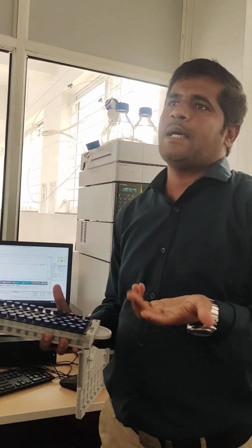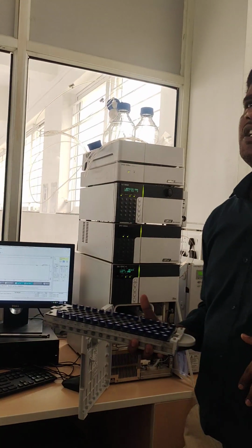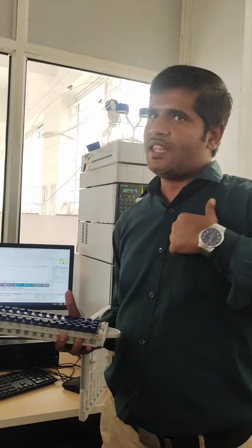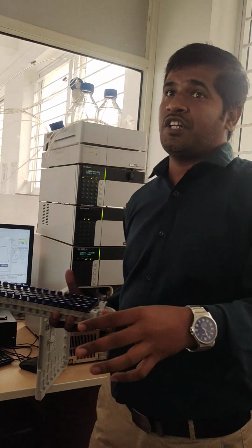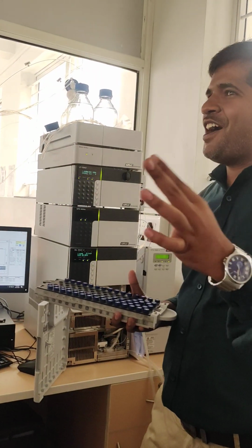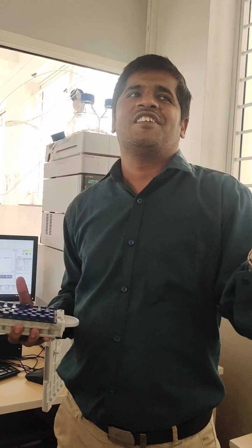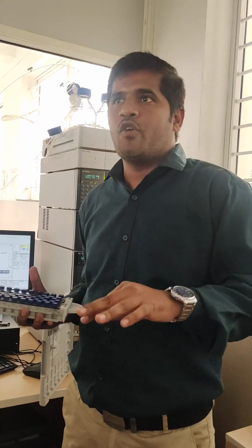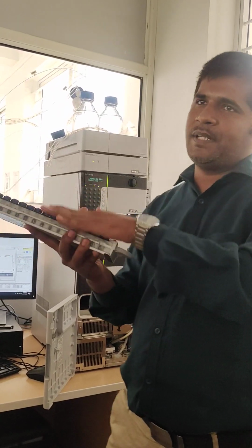They sent samples for HPLC analysis to our college, and they wanted to know the pharmacokinetic parameters, like the percentage of drug release in the body, T-half, elimination rate, onset of action, and duration of action. For that they sent the samples.